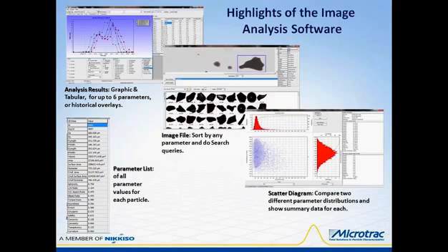Next, going clockwise in the image file display, all images in the saved video file can be displayed, sorted on any parameter, and a search query can be made to isolate particles within limits of various parameters to create different classifications of components within the total sample.